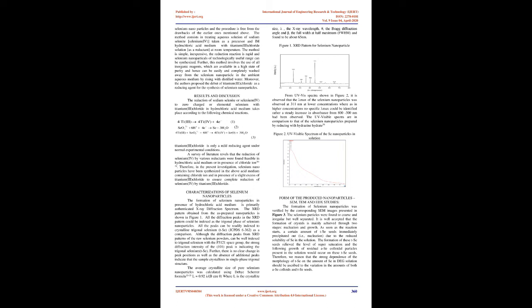The reduction of selenium(IV) by sodium ascorbate or ascorbic acid is extremely slow and requires about 5 hours to realize the formation of nanoselenium. The reaction with polyvinyl alcohol must be carried out at elevated temperatures, 140°C for 48 hours.